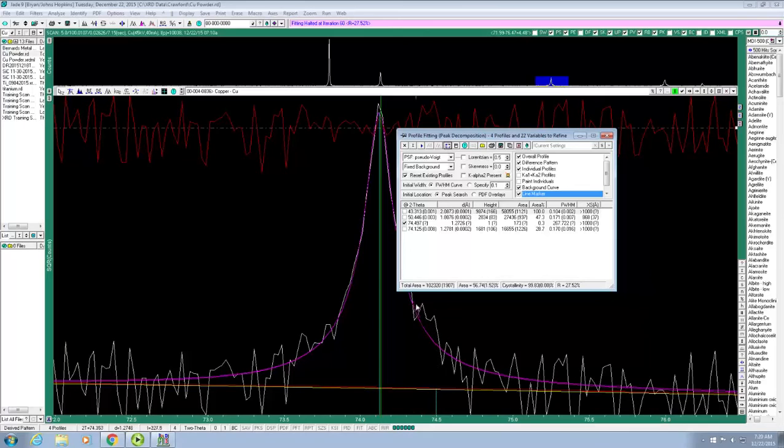Notice I don't really see a peak here. There's what it thinks is a small peak there. Let's get rid of this one. It is questionable. It has marked it. And we will tell it to get rid of that one just by hitting Erase One Peak. That erased the wrong peak. That's not the one I wanted to erase. Try that again. There we go.